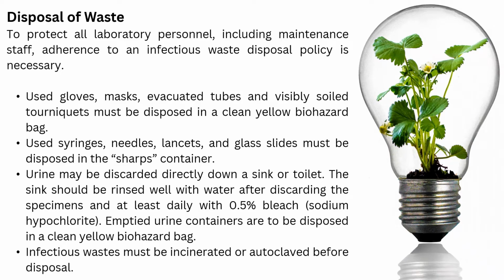Used syringes, needles, lancets, and glass slides must be disposed in the sharps container. So that's in the sharps container. While for those soiled items or PPE, that's in a clean yellow biohazard bag. While those that can cause mechanical trauma, such as syringes and needles, that's in the sharps.